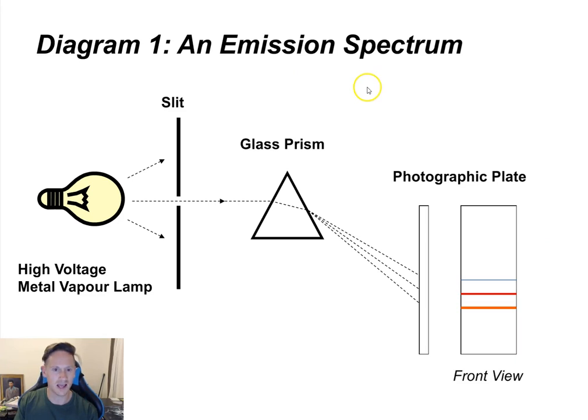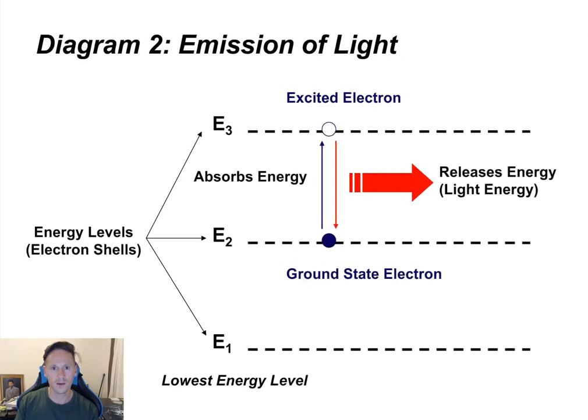So basically that's saying that certain elements will produce light of certain wavelengths. We've done flame colors testing, for example. You've seen fireworks before. And if you've got different colors, that's due to different elements, okay? So sodium has your orange light, copper has your greeny blue light. This is why light is being emitted, okay?